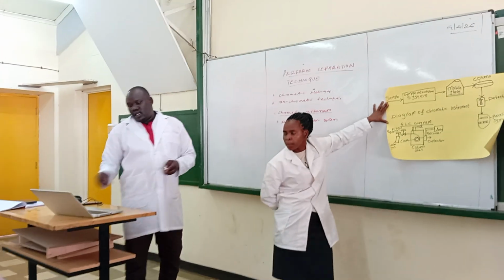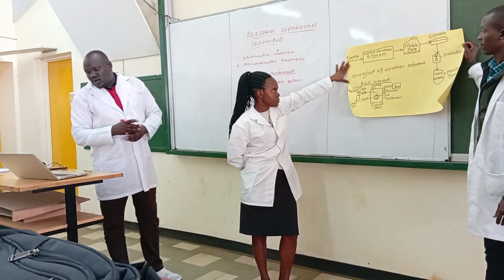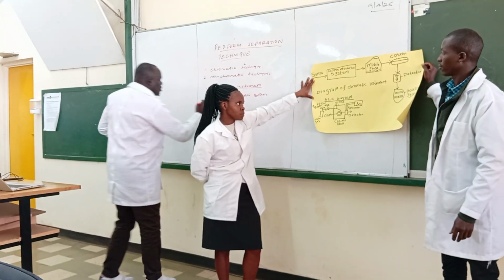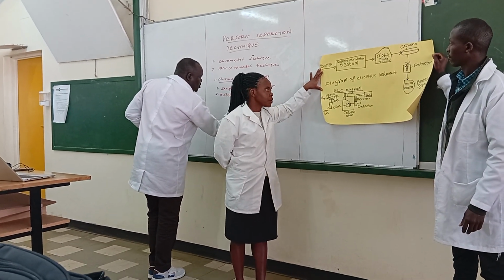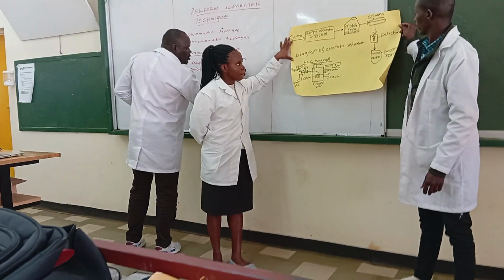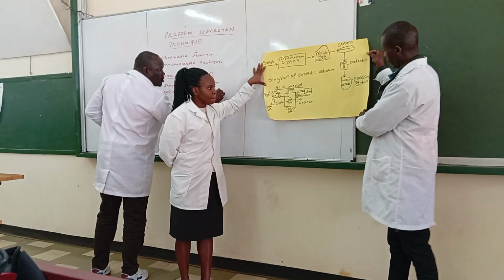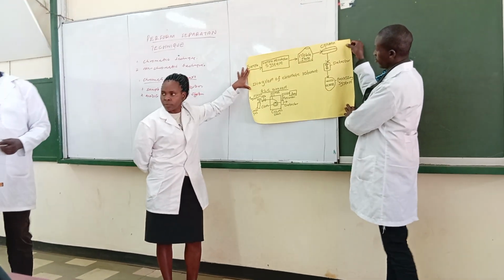The second one is the mobile phase delivery system. What happens in the mobile phase?